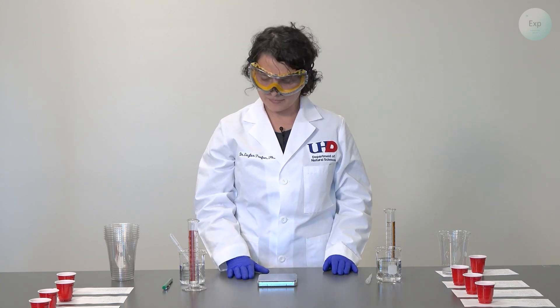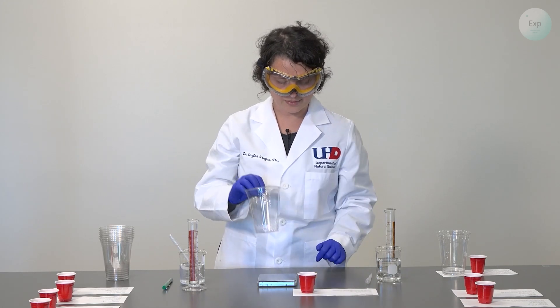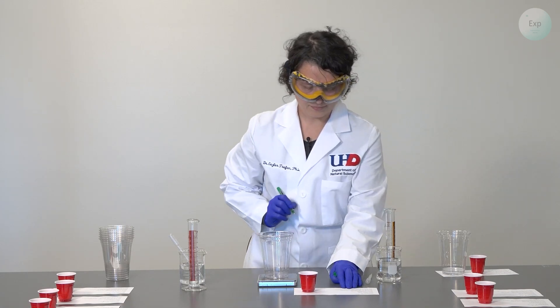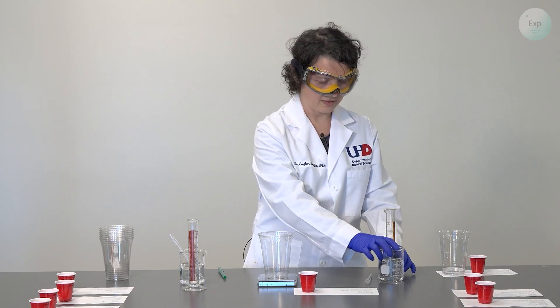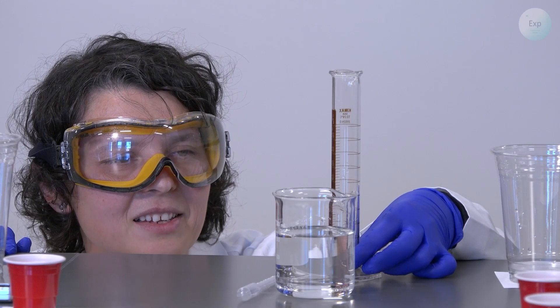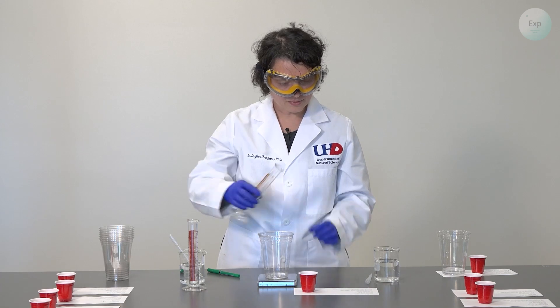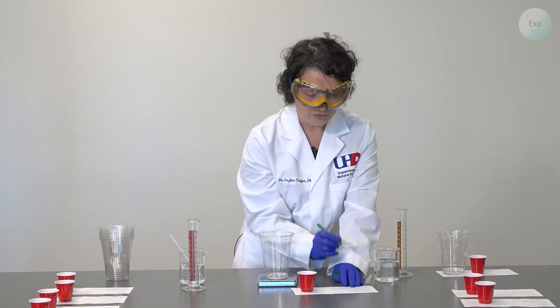For experiment two, I am going to use another cup and place it on my sheet with my experiment two details. I will place the cup on the scale and record its mass: 14.65 grams. Then I am going to add five milliliters of vinegar from my left side. It is a little more than five — 5.9 milliliters — and I want to make sure that I record that.